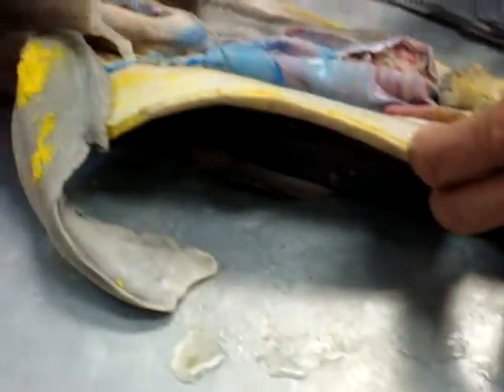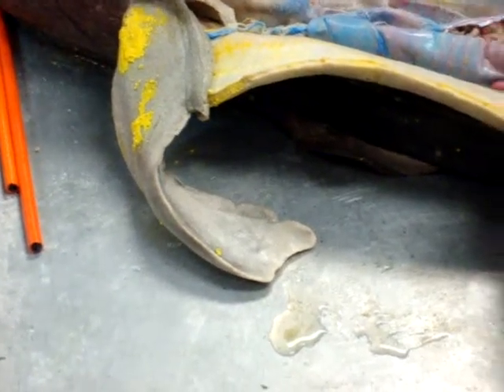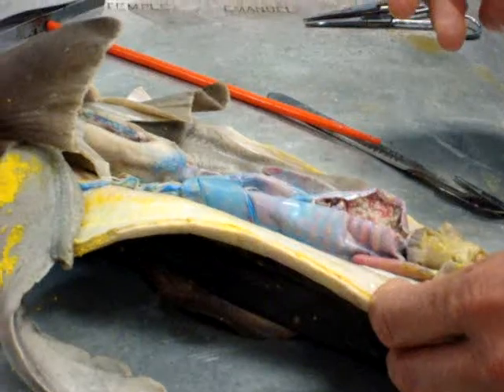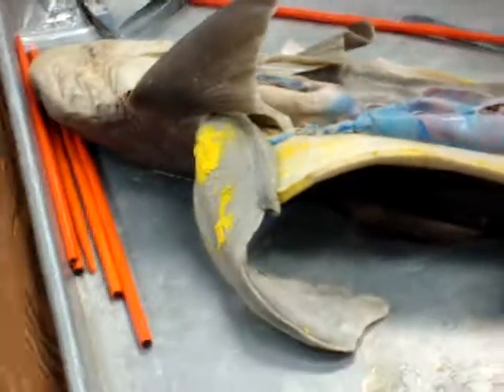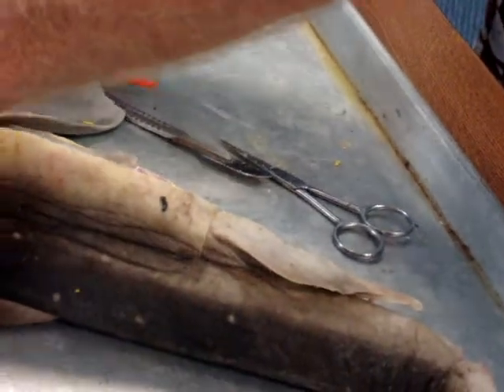We've got time. What's underneath the small intestines, guys? What do we put for that? That's going to be part of the reproductive system. We're going to wait on that one. One looks like a V. What about what's under the liver, like a small pouch? Those are going to be reproductive as well, which is strange because those are actually testes. The thing on the neck, that's going to be the heart. We're going to get to that next. And are these the nares? Those are nares, yeah. You just drew it in.